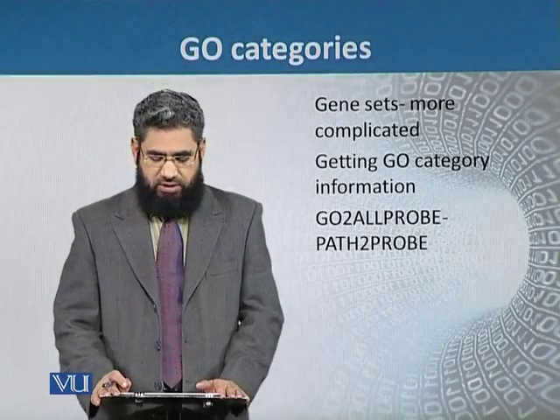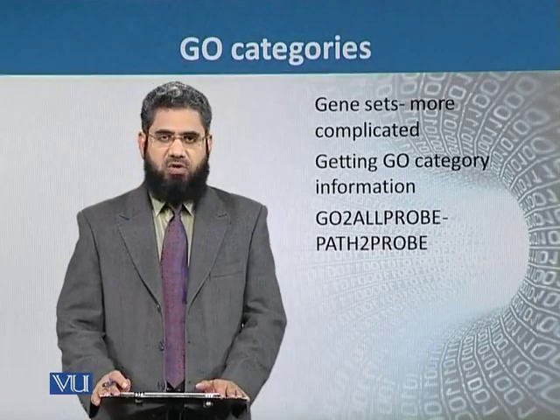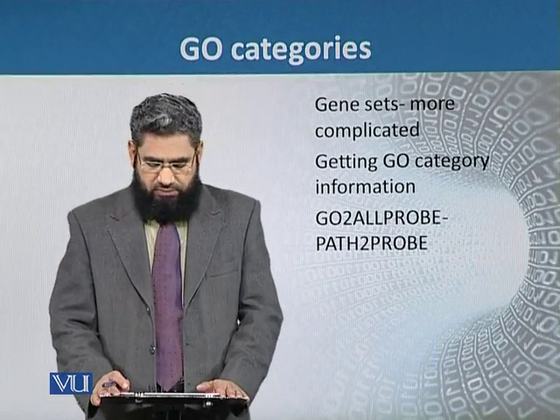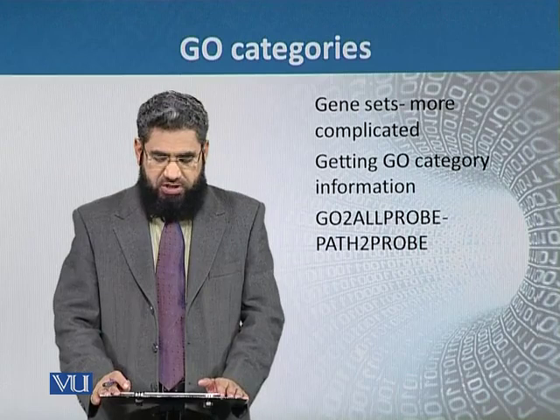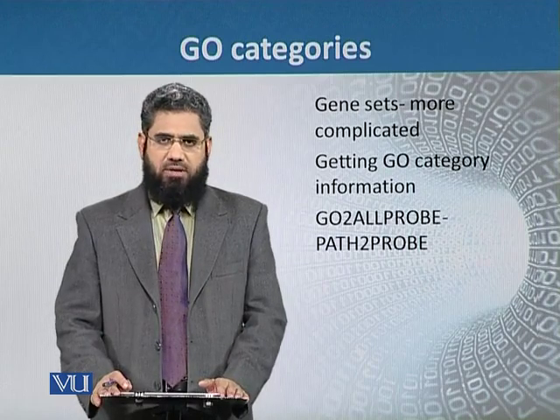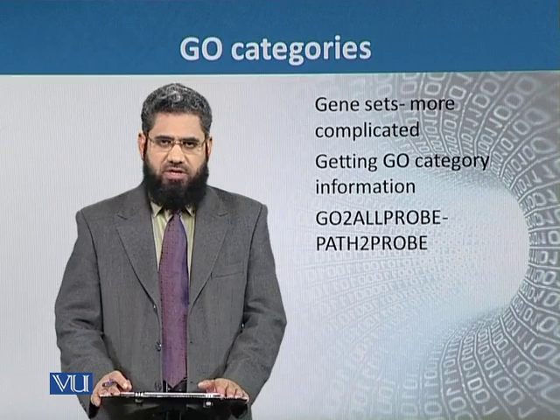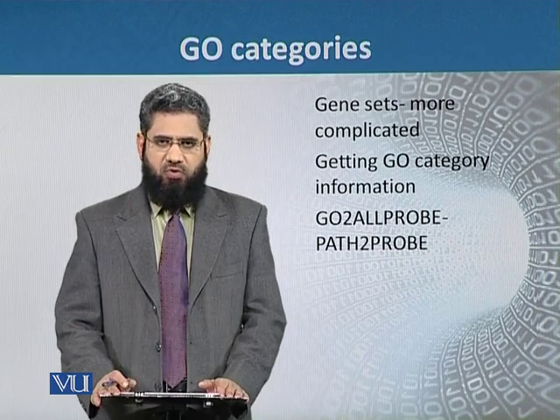Now we will see the gene set test for GO categories. The gene set tests for GO categories are slightly more complicated in comparison with the KEGG pathway test we have performed previously.